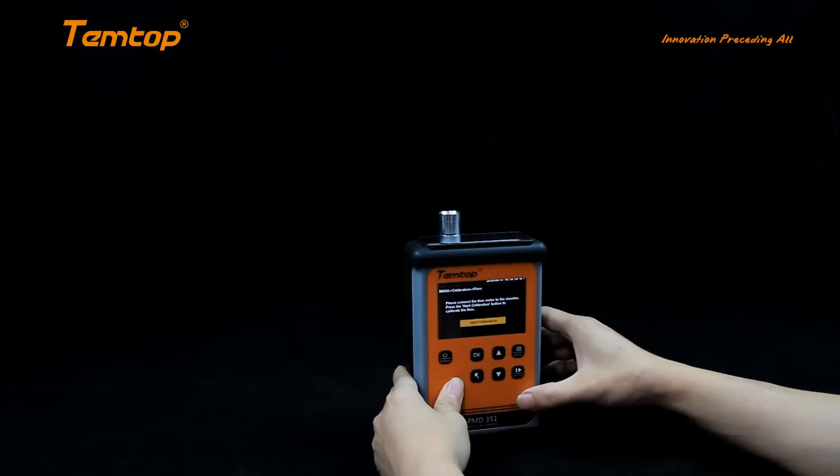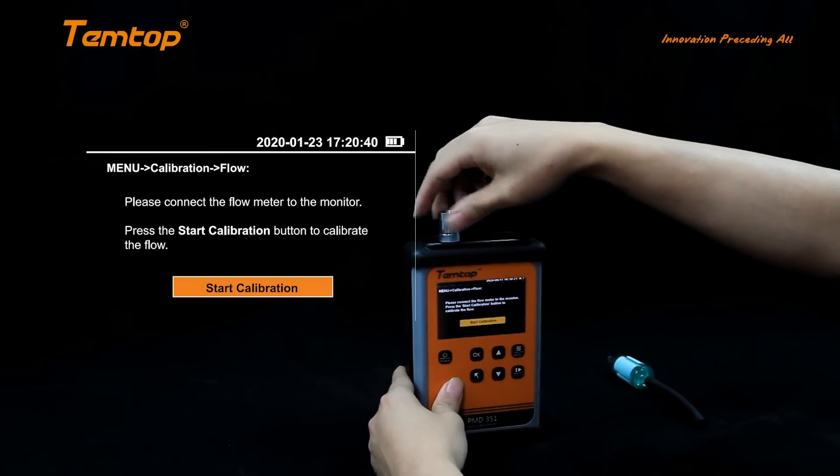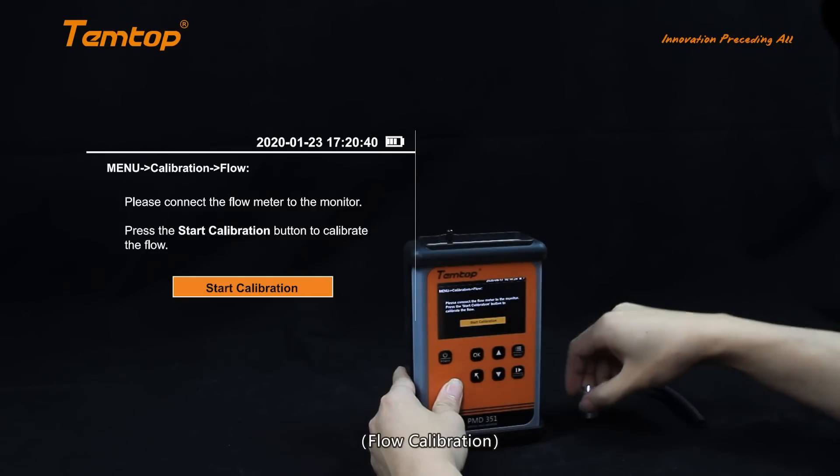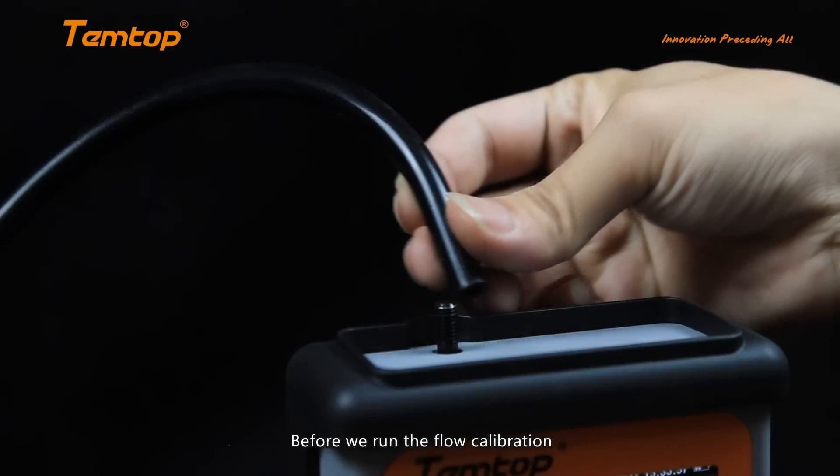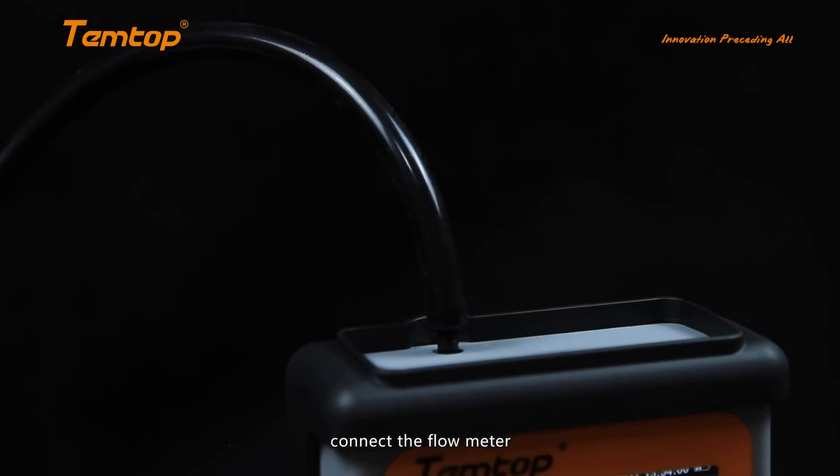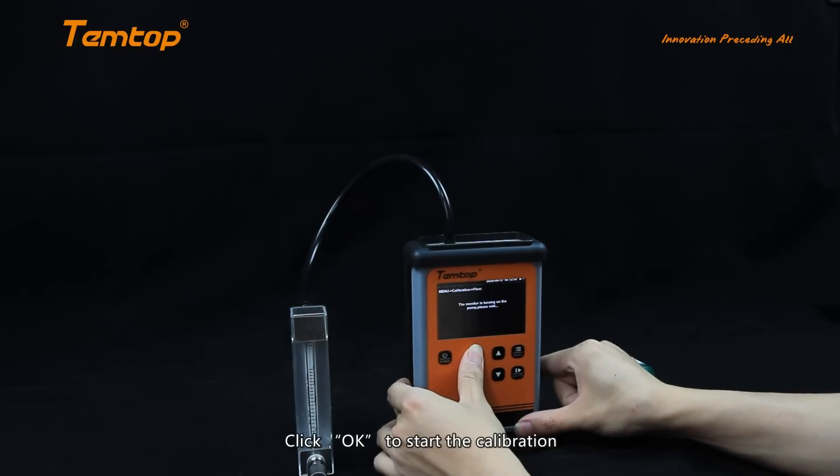Flow Calibration. Before we run the flow calibration, remove the intake cover and connect the flow meter. Click OK to start the calibration.